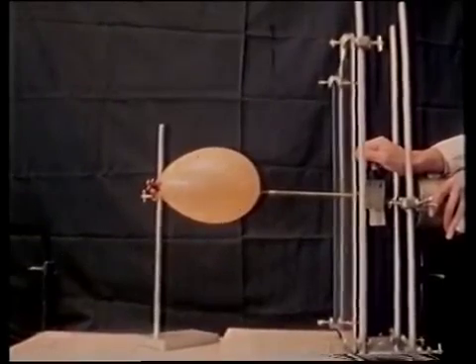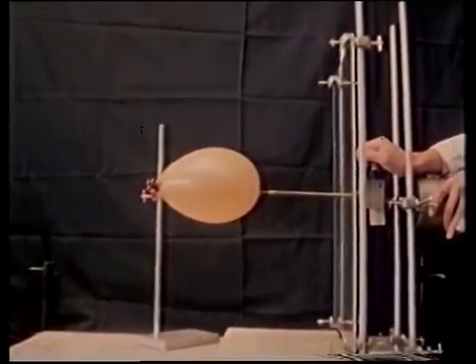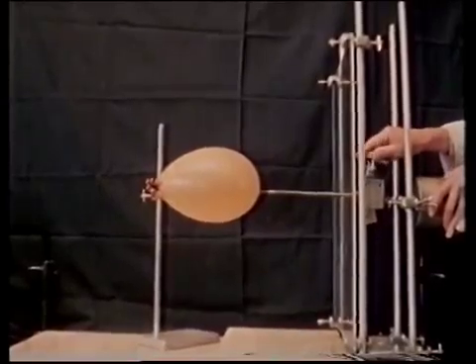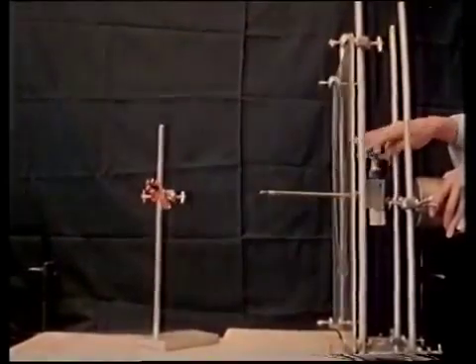To answer these questions, we need to look more closely at what happens on the molecular level when substances react together. The reactions you've seen so far are a bit complicated, so let's start with a simpler one. It's a combination that's been investigated by NASA as a possible rocket propellant, the reaction between hydrogen and fluorine. The hydrogen is in the balloon on the left, the cylinder on the right contains fluorine. Let's see what happens when we fire a jet of fluorine at the balloon.